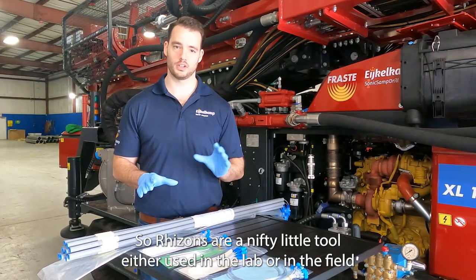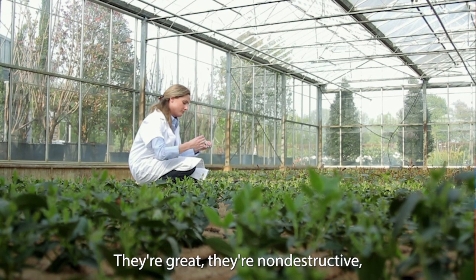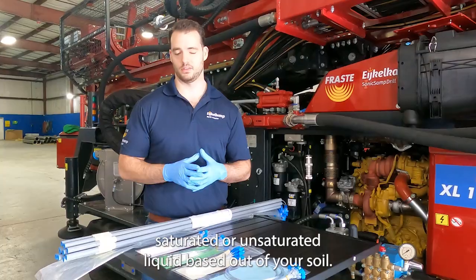Rhizons are a nifty little tool that's either used in the lab or in the field for measuring that moisture. They're great, they're non-destructive, they're chemically inert, and they're perfect for sampling that saturated or unsaturated liquid phase inside of your soil.